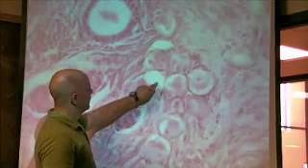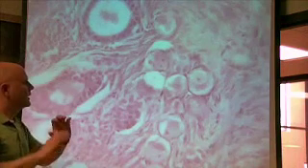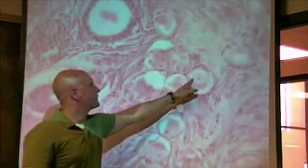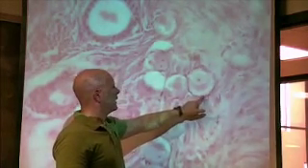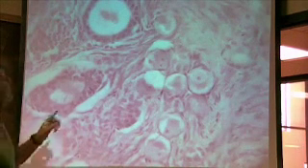These little guys, here, here, here, here, here. Those are primordial follicles. So essentially what you're seeing there, it looks just like an oocyte. There is a small ring of cells around there, but you're not seeing much of anything.